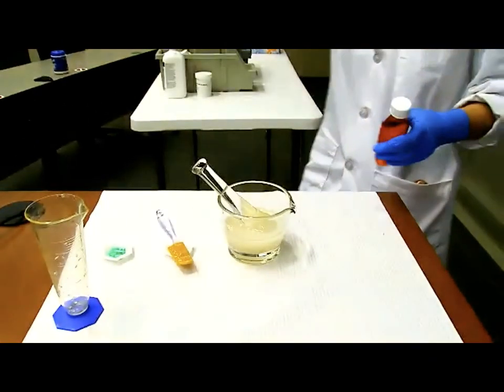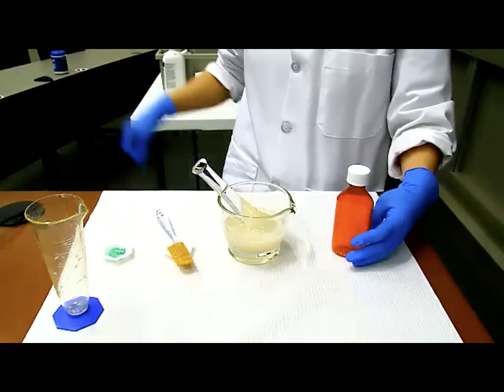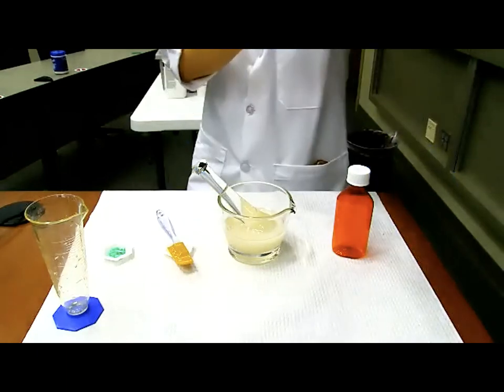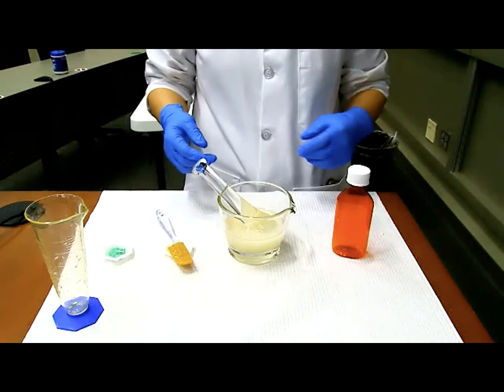But how much are we going to transfer? Because we made 100 mL. So we're not transferring everything because it's excess. Based upon the script, we only need 80 mL. So we are transferring only 80 mL.